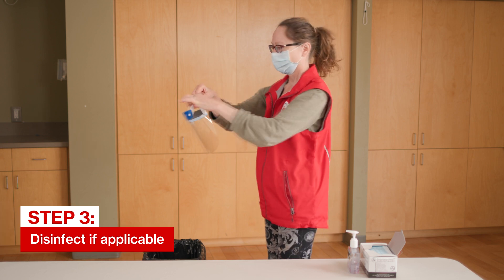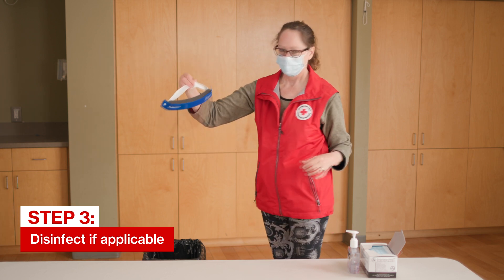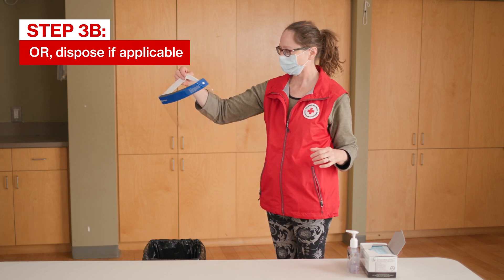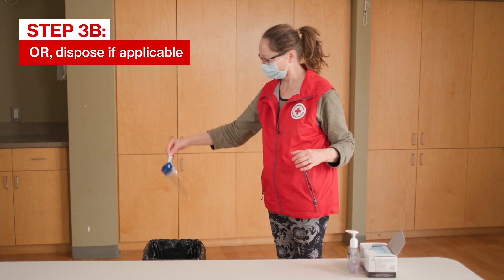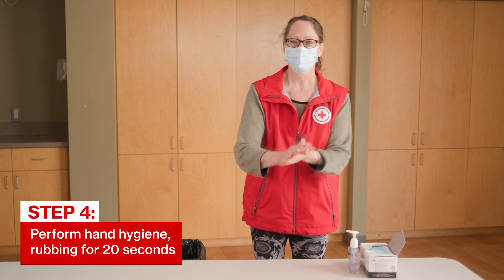If the eyewear is reusable, follow your program's protocol to disinfect it and store in a clean place where it won't be damaged. Otherwise, discard the appropriate pieces, like the disposable face shield, into an appropriate waste container. Perform hand hygiene.